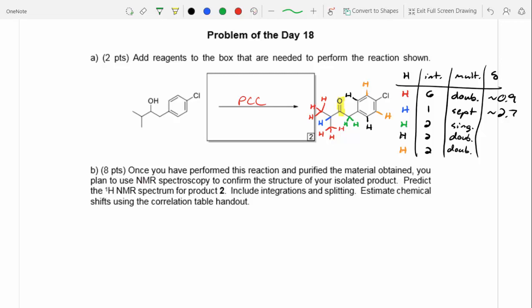Yeah, the aromatic rings, like we saw yesterday, have an induced magnetic field that oftentimes causes shifting to a higher ppm. So what we would expect if we didn't have a benzene, that signal should show up at about 2.2, but the benzene will likely cause it to be bumped up probably another 1 ppm.